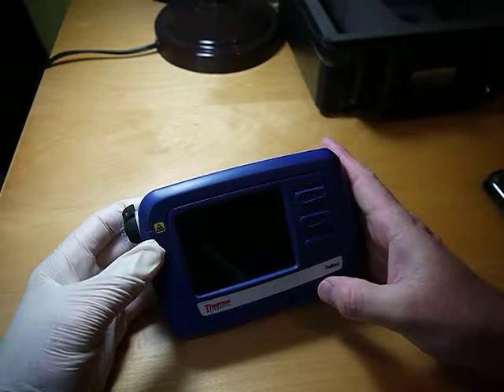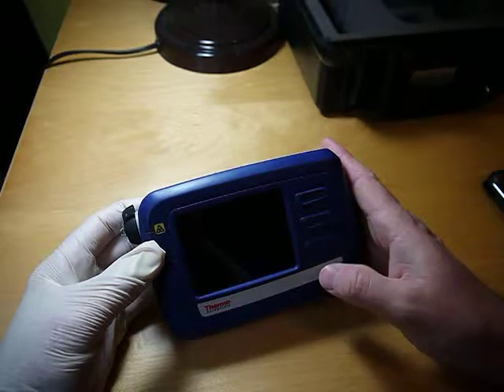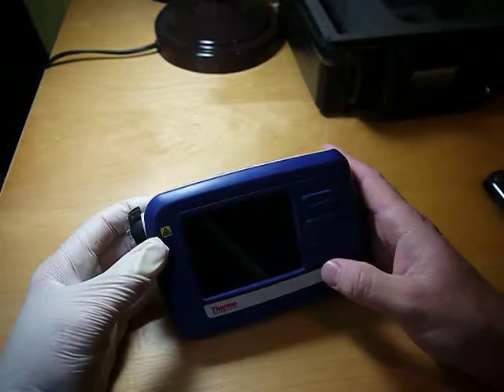Today I'm going to show you the Thermo Scientific TrueNARP. It's a handheld narcotics analyzer that uses Raman spectroscopy to take a measurement of different — well, anything you want to test, basically.